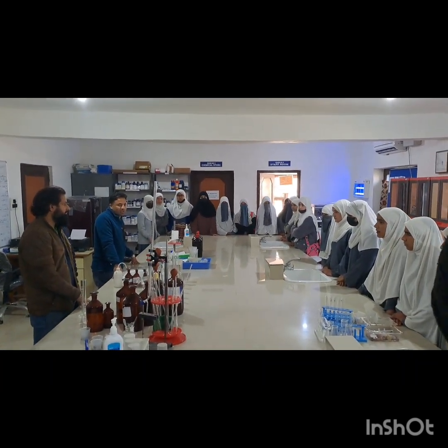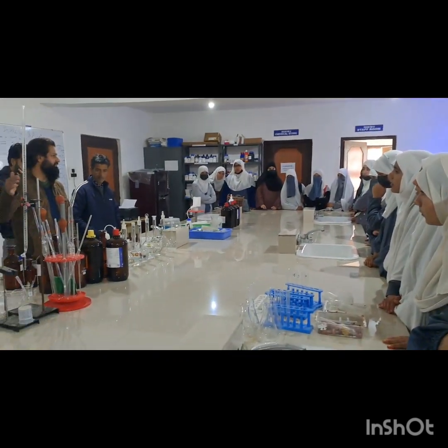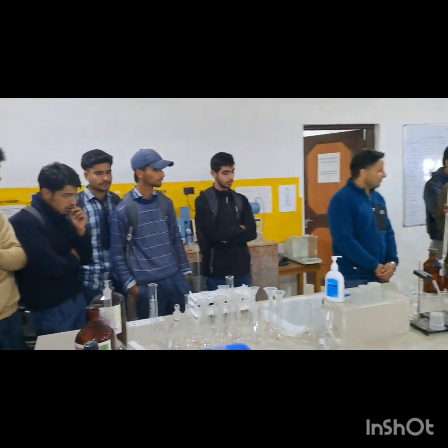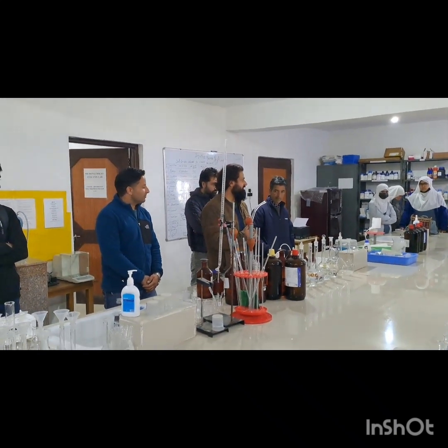1. Introduction to soil testing. Dr. Inam explained the basics of soil science, including the different layers of soil, types of soil, and the importance of nutrients for plant growth. The students learned about macronutrients, such as nitrogen, phosphorus, and potassium, and micronutrients, essential for soil fertility.